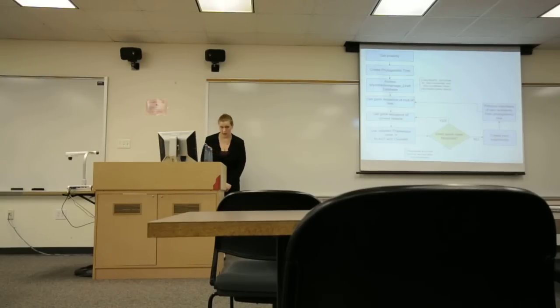So in order to do so, this is the general flow of information for our program. It first gets a family from the Mycobacterium phage draft database. It creates a phylogenetic tree using ClustalW. Then using the BioPython module called Phylo, it accesses the name of the root of that tree, then accesses the name of the sequence of the closest relative, grabs them both, and using a retooled FamRater code, runs BLAST and Clustal alignment on them. If the score meets the threshold, this means that they are similar enough to remain in our family, and so it goes back and grabs another.